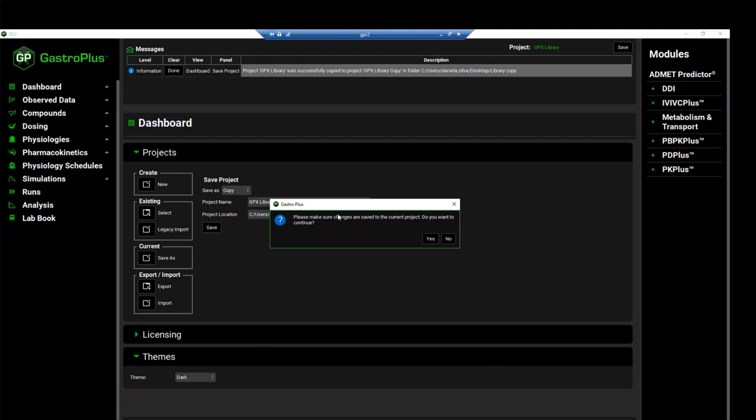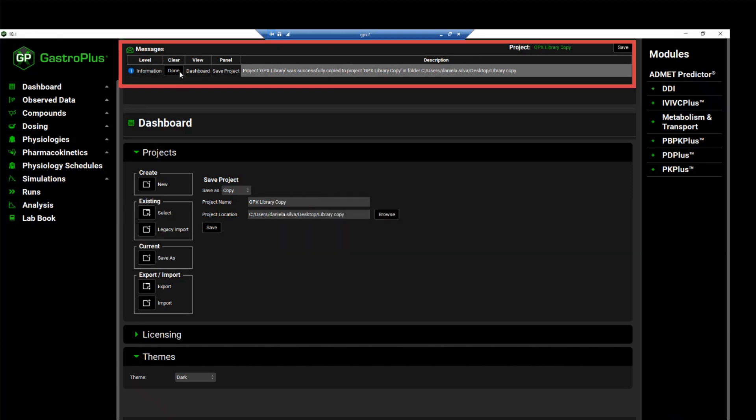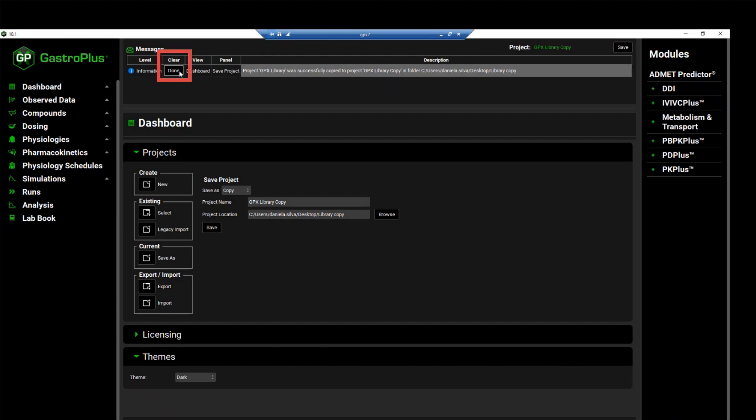After doing that, click on save to save a copy of this project. A pop-up message will appear asking you to make sure that any changes that have been made in the current project have been saved. And you can click yes on this message. An information message will appear in the messages center letting you know that the GPX library was successfully copied to GPX library copy. Click done to clear the message.